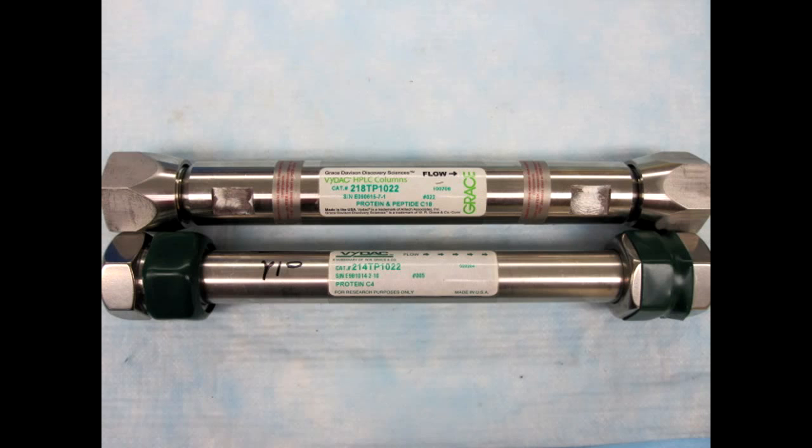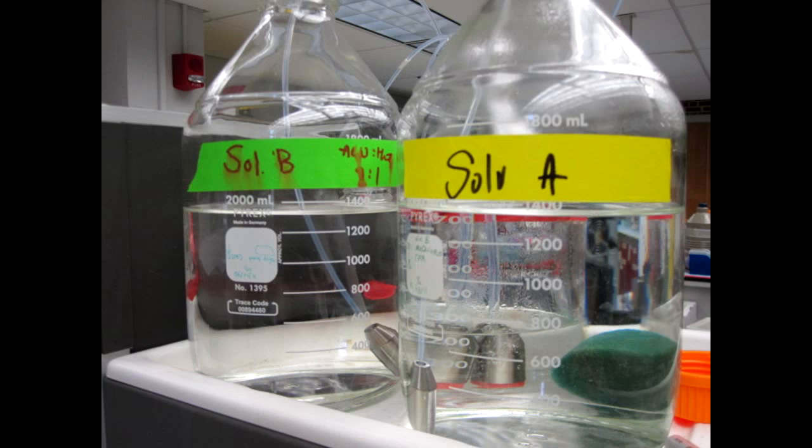For HPLC, our stationary phase includes various hydrophobic C4 and C18 reverse phase columns. We usually use C4 for large proteins and C18 for smaller peptides. For our mobile phase, we utilize the ability to make gradient mixtures of two distinct polar solvents in order to maximize the purification of our peptides.